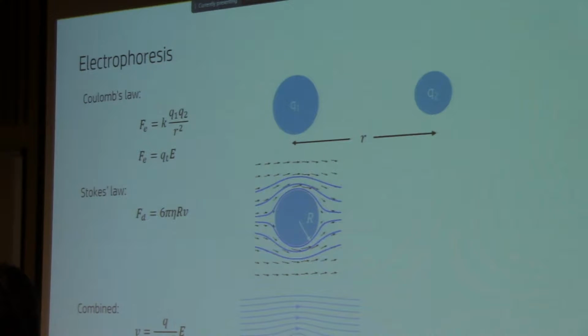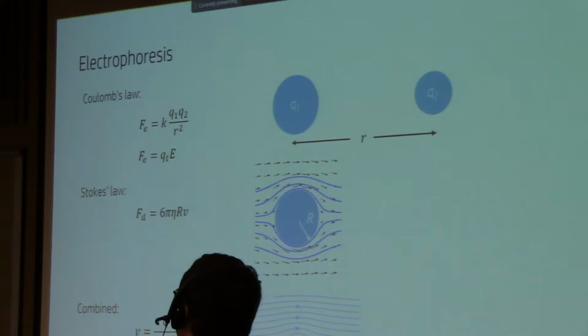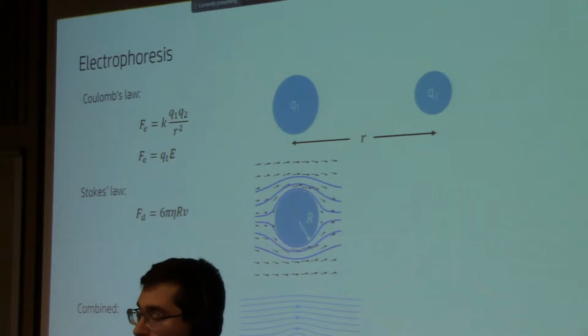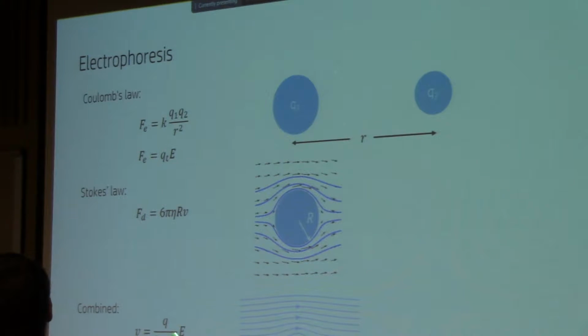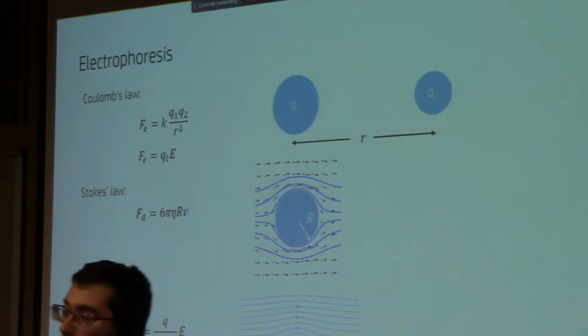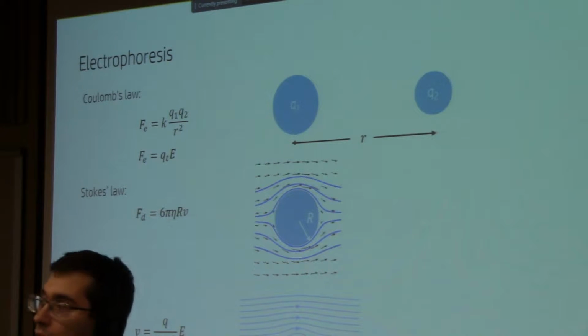Now, this is a little bit simplified. Electrophoretic mobility scales like this, but it's not exactly this. The reason is that this radius, for most objects, is not well defined. An ion is not a hard body like this chair, where you hit it and you know where its dimensions are. An ion has a probability cloud of electrons around it, for example.